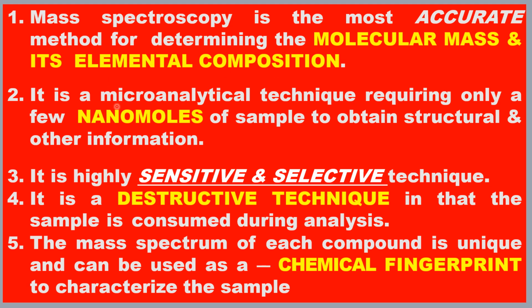Okay, next, it is a microanalytical technique. Requires only nanomoles of sample to obtain structural and other informations. It is highly sensitive and selective technique.